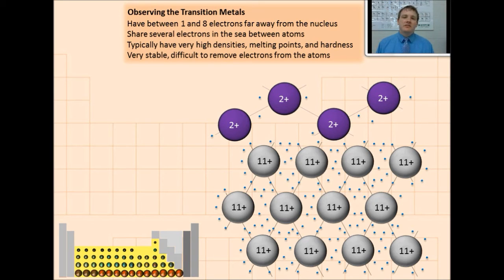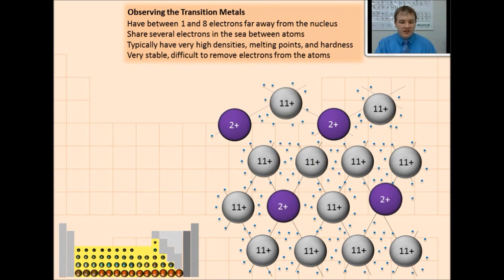That's not going to be the case with the transition metals. The transition metals are so unreactive that even when we put them together and heat them up, put them under high stress conditions, they're not going to undergo a chemical change, but a simple physical one.